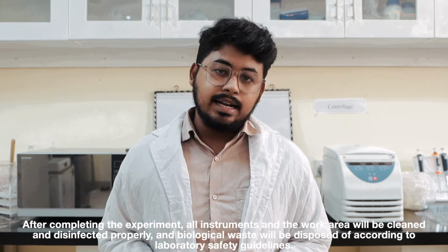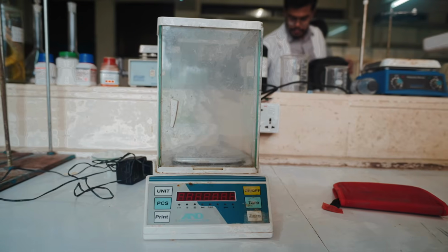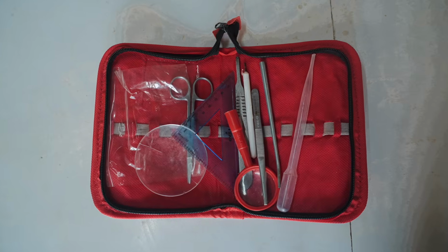Here is a list of what we used for the determination of GSI and HSI in common carp. We used fish sample, Cyprinus carpio, analytical balance, weighing machine, measurement scale, dissection box, and forceps.